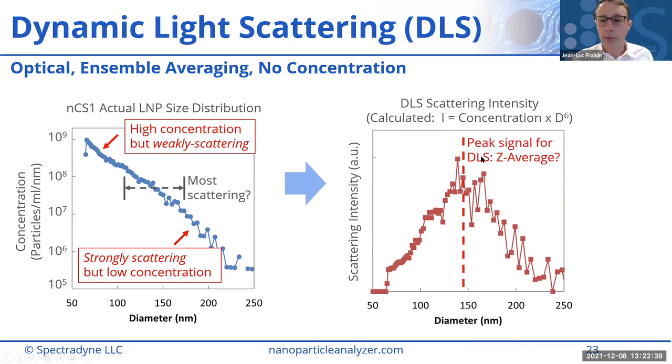So it's no wonder, but this is an example that a very complicated size distribution like this, it's a broad power law, essentially, size distribution, very commonly what we see in the field for this kind of material, shows, quite reasonably, for good reason now that we know how DLS works, a peak in the scattering intensity distribution.